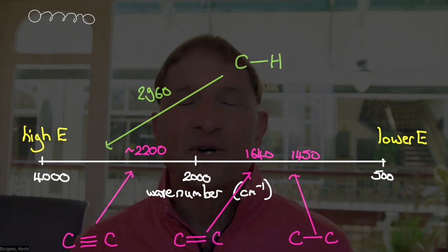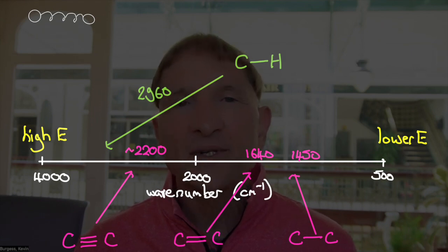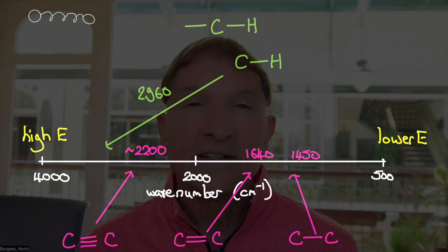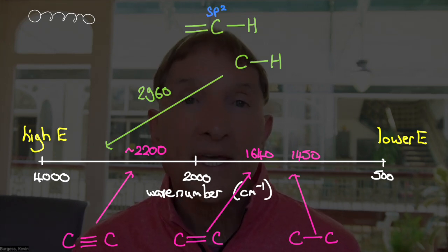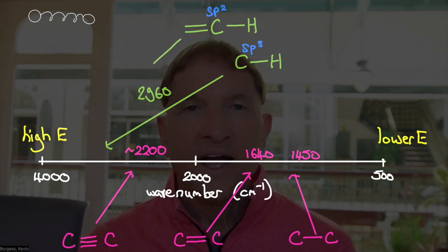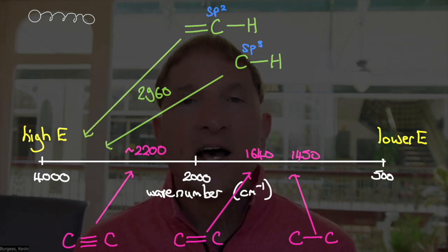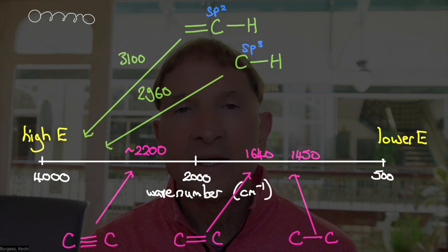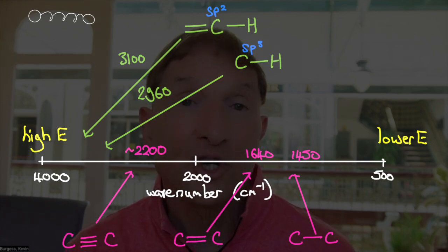Alkane C-H bonds contain sp3 hybridized carbon atoms. Those are weaker than alkyne C-H bonds, which have sp hybridized carbon. Electrons in sp hybridized orbitals are closer to the nuclei than in sp3 because they have more s content in the bond.